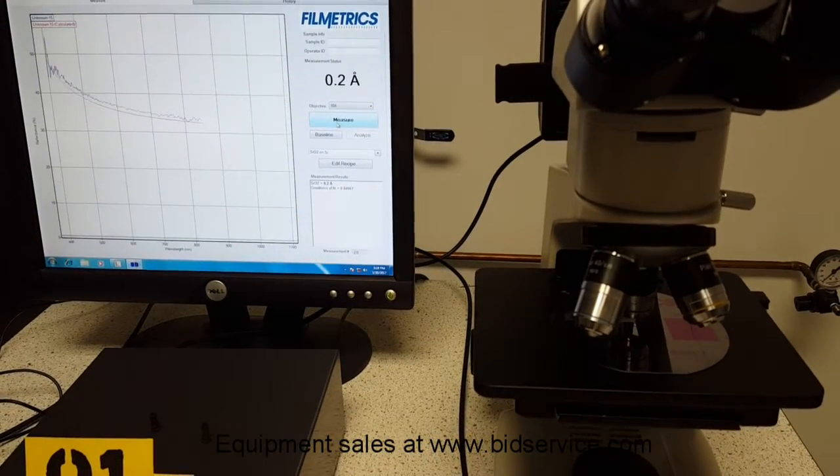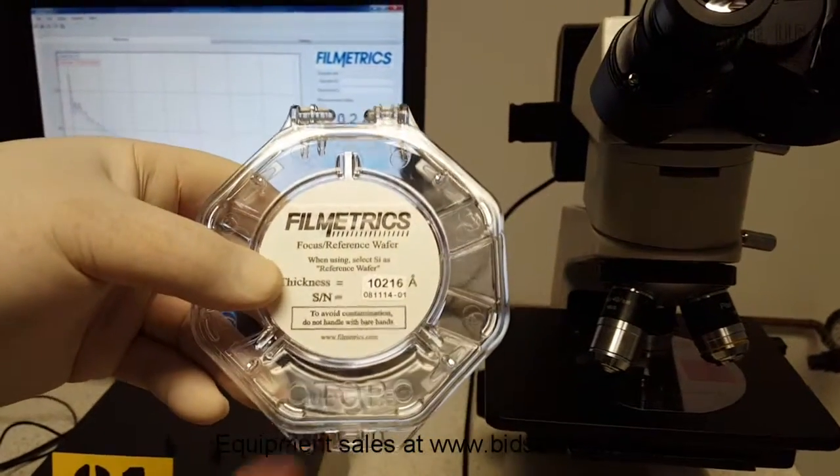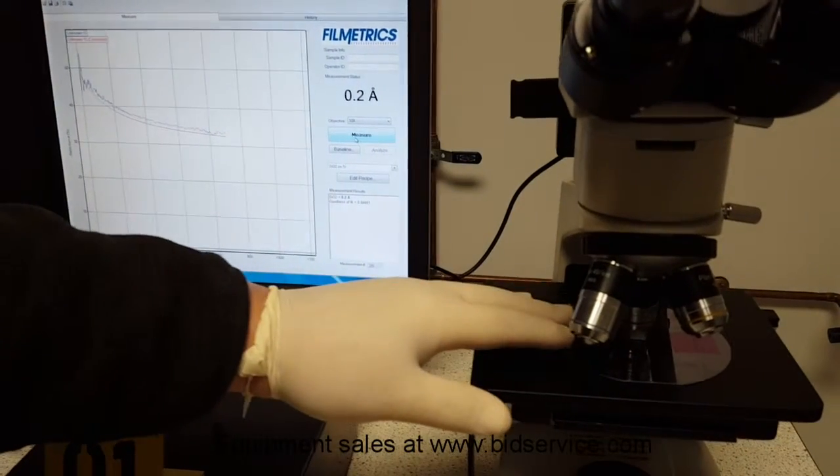The other part is the silicon oxide on it, and you can see it's 10,216. So I'm going to slide it on over again.